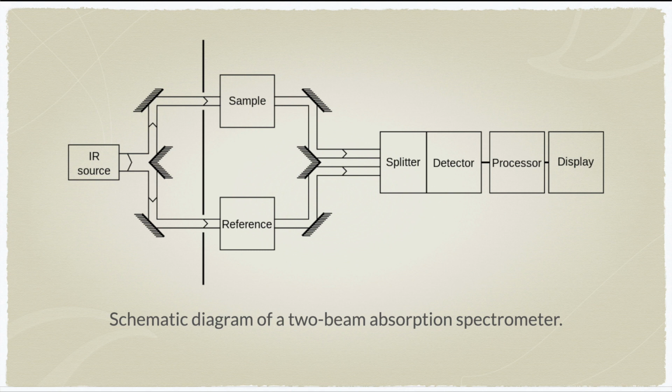It's not like when you do a scanning type of spectroscopy. So I'll not go into the detail of the technique of Fourier transform. If you are interested, you can read about Fourier transform. There are many available sources on that. But the main difference is that Fourier transform will speed up the process compared to the scanning method.